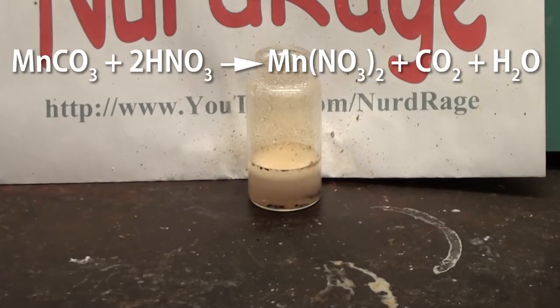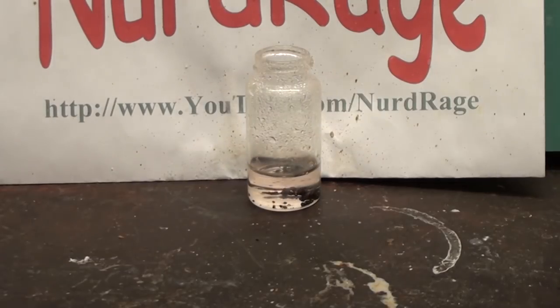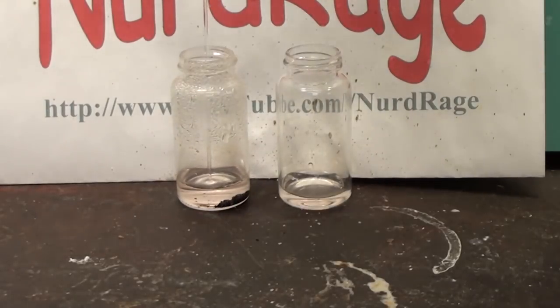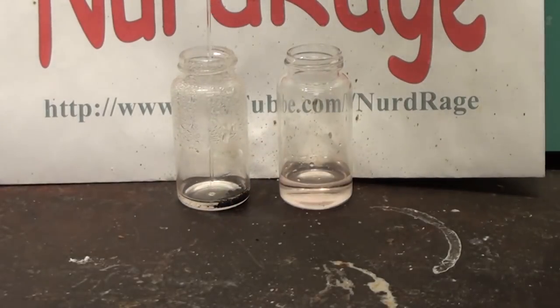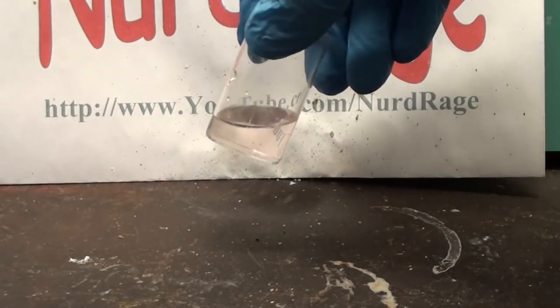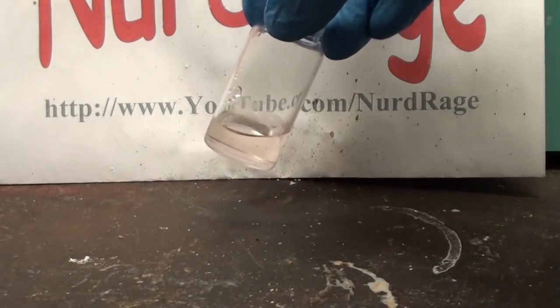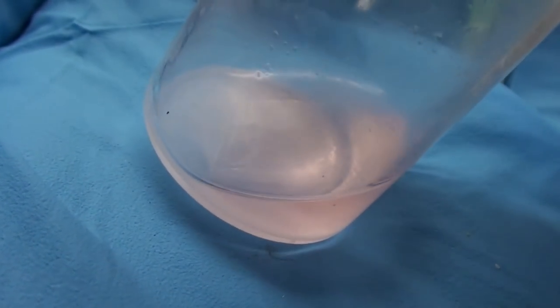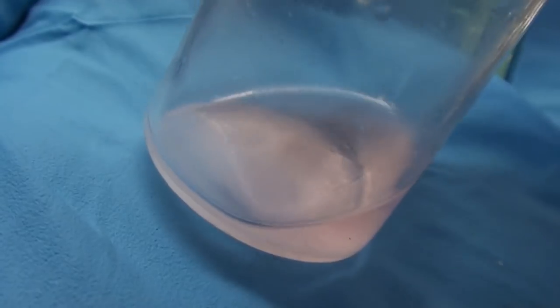The nitric acid will neutralize the manganese carbonate and produce manganese nitrate and carbon dioxide. After all the nitric acid is added, wait until the bubbling stops. Now pipette the liquid to another container away from the excess manganese dioxide. This solution of manganese nitrate can be used directly, but I recommend evaporating it until you produce a saturated solution for best results. You can tell when it starts to precipitate pink or white powder or crystals of manganese nitrate.